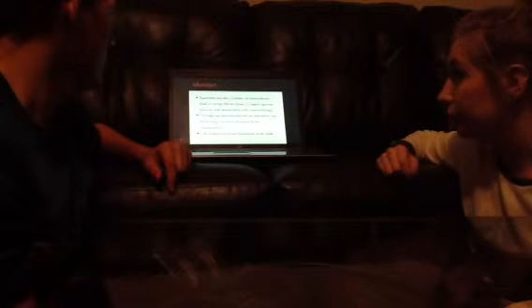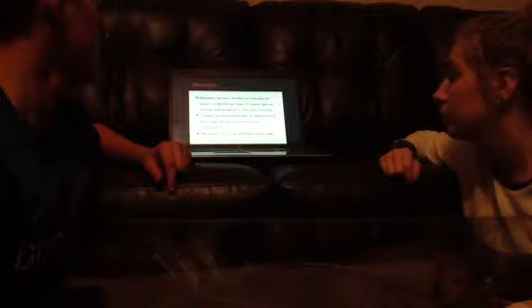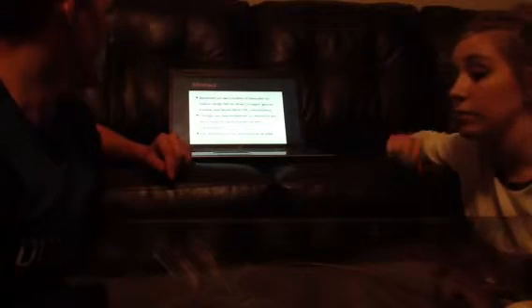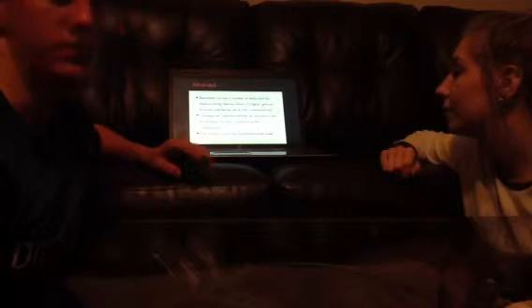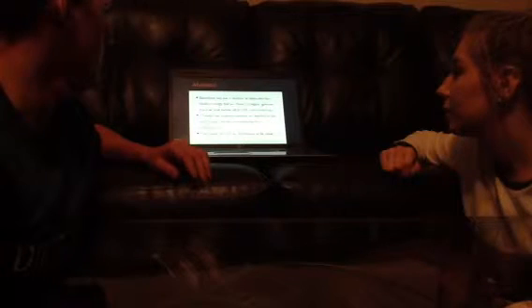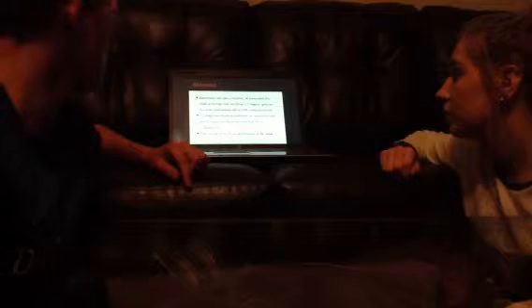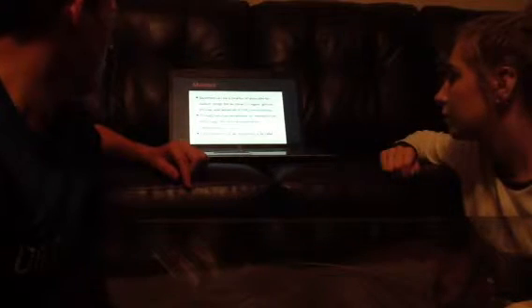Our abstract. In our abstract, we stated that a bacterium can use a number of molecules for food or energy, but we chose three. We're using glucose, fructose, and lactose, all in 20% concentrations. Through our experimentation, we're going to test which sugar the bacteria preferred best for consumption. When we tested our hypothesis, we came to the conclusion that it was valid.